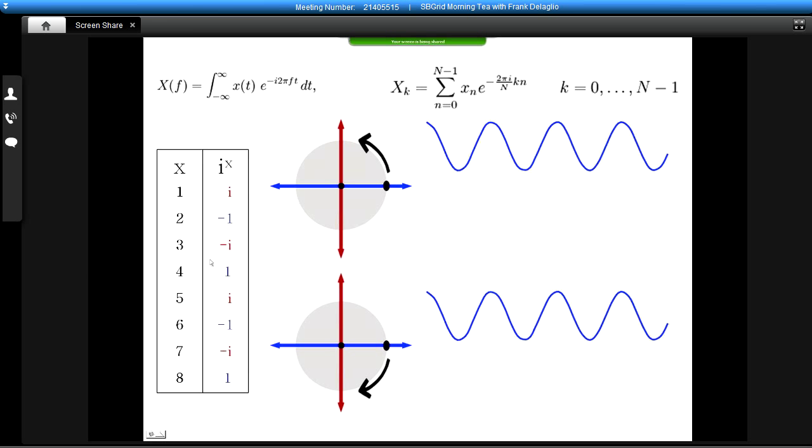Well, we're talking about frequencies in NMR, and one way to represent frequencies is to consider orbiting particles. And we can establish all the parameters about a particular frequency by considering an orbiting particle. And the size of the orbit corresponds to the amplitude of the signal, and the speed at which the particle orbits corresponds to the frequency.